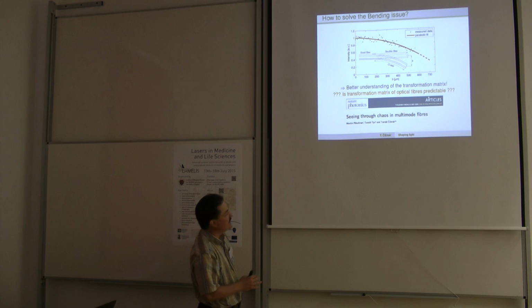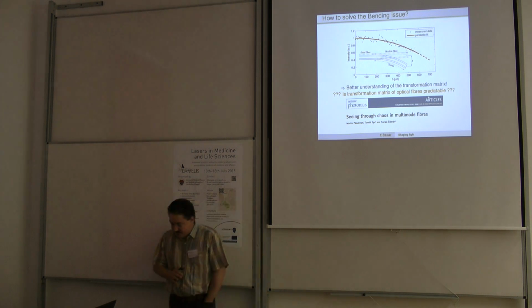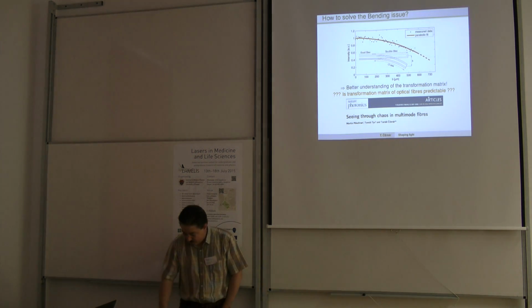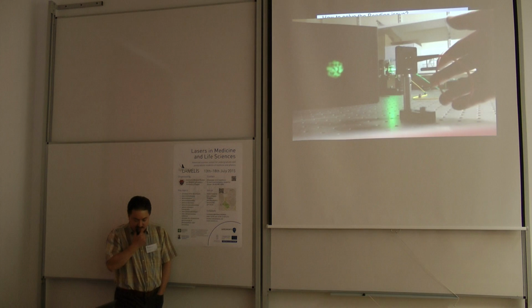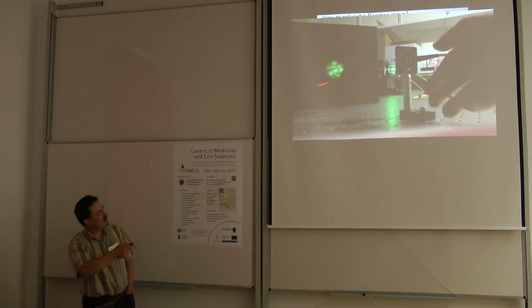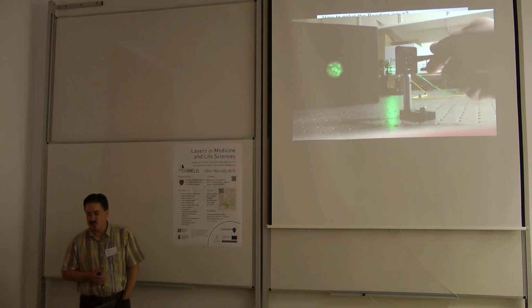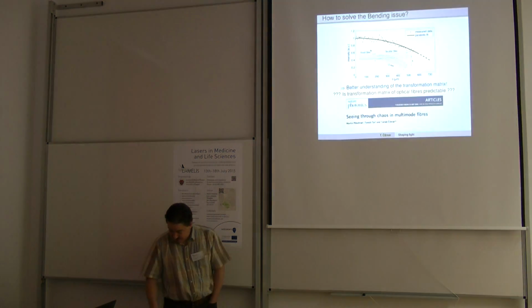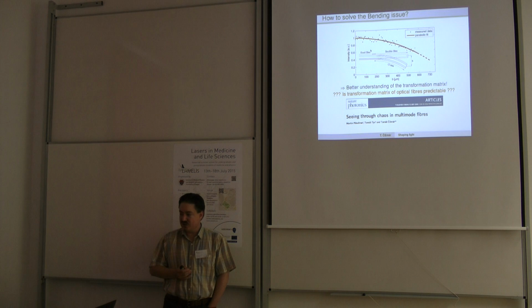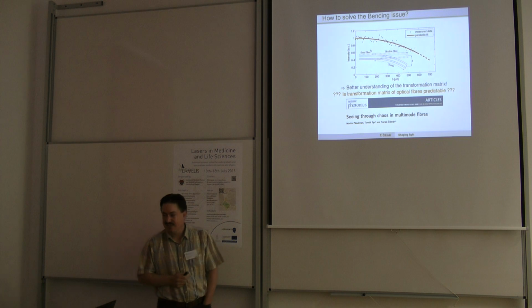So yeah, this is how far we can go without any flexibility, right? We can still apply the fibers with some limitations, but the problem with the flexibility was bothering me for some time. So just to give you a flavor of how strong it is, this is me just playing with quite a small fiber. It only has a couple of hundred modes. So basically, if you deform the fiber, the speckle pattern changes, right? You could say it's quite dynamic, it looks hardly predictable, right? And I can proudly announce that we actually managed to crack it up to a certain extent, and it was published in Nature Photonics just yesterday, right? So very new thing worth looking at.